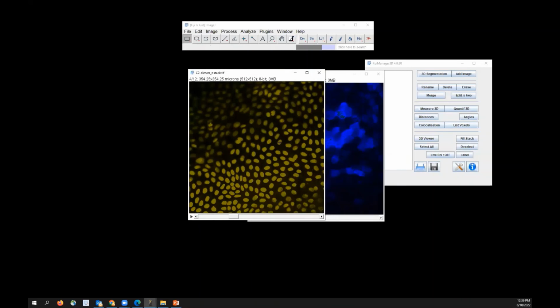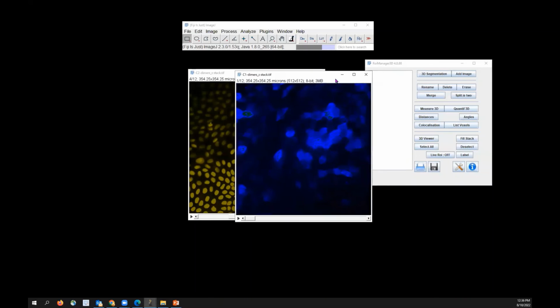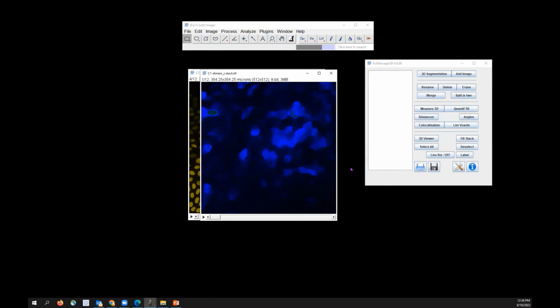The original regions that you had here, when you added the segmented image, you will now apply to this image. You just need to select all the objects here, put ROI to live, and you'll be able to see where your nuclei are located and calculate your measurements. So that's how you can apply your regions to a different channel of your image. So that's all about thresholding.